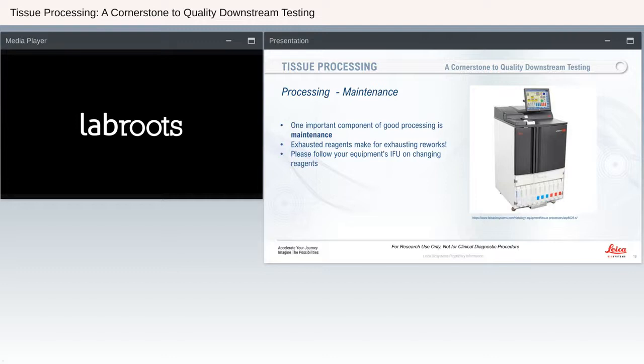As you see here, I put that exhausted reagents make for exhausting reworks because it will require either reprocessing of the tissue or taking another sample because the tissues can't recover what damage has been done. It is very difficult to remove residual xylene once it's in the tissue, to get it out, to go back. Usually another sample has to be taken.